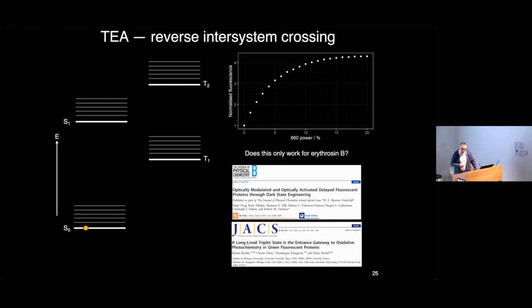And more recently, there's been a very, very detailed study about the triplet state within green fluorescent protein, and they found there that this triplet state has a lifetime of 5 milliseconds, which is ridiculously long in comparison with a normal dye. You might be of the order of 10 microseconds. So when you get into this triplet state, which remember happens with 1% yield, this electron is staying there for a very long time, and therefore has plenty of time to bump into something to react with.